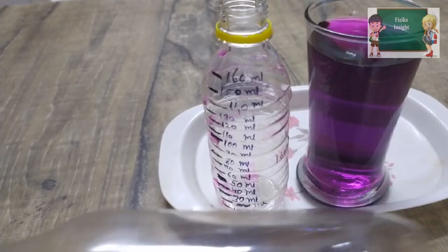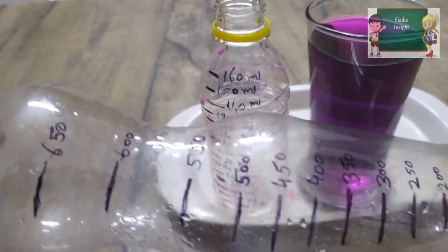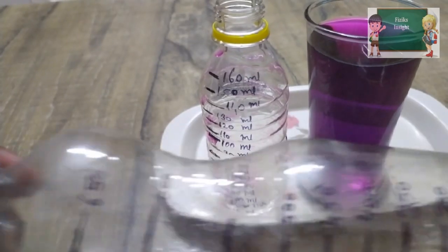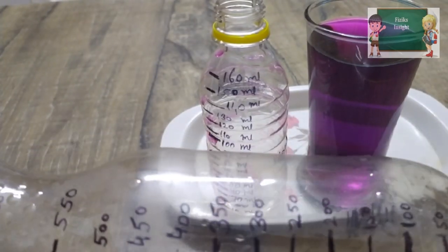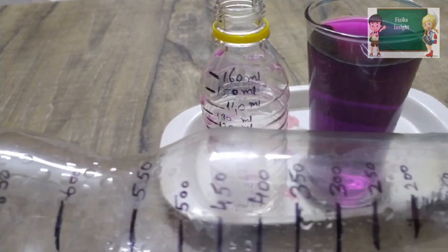In a similar way, we have also made a cylinder of 650 ml using a 50 ml cylinder by making graduations of 50 ml each.